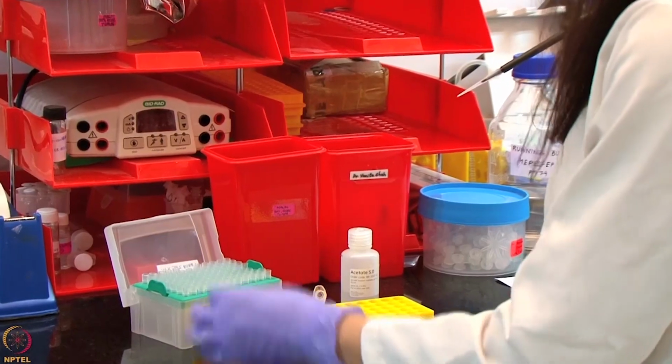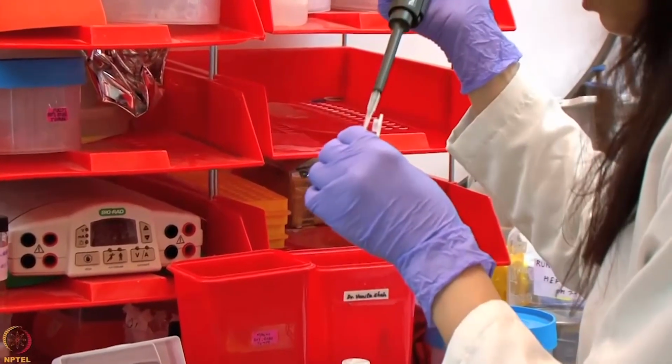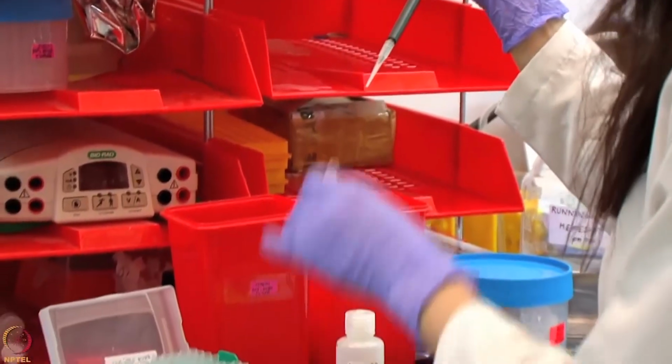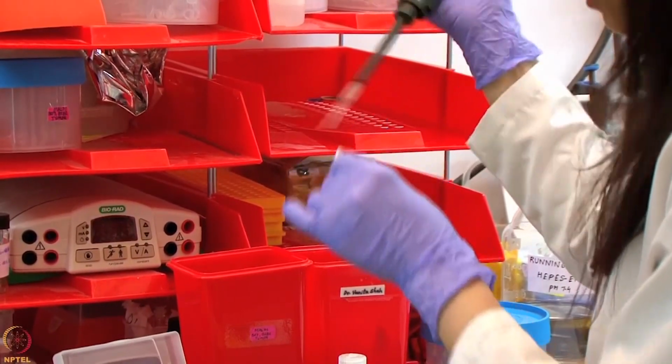For this, we will take 6 microliter of the ligand stock and mix it with 194 microliter of sodium acetate pH 5.